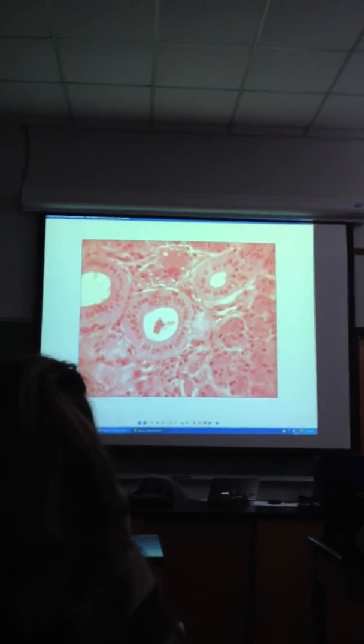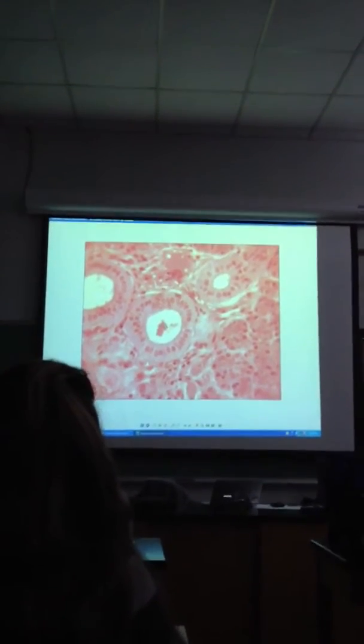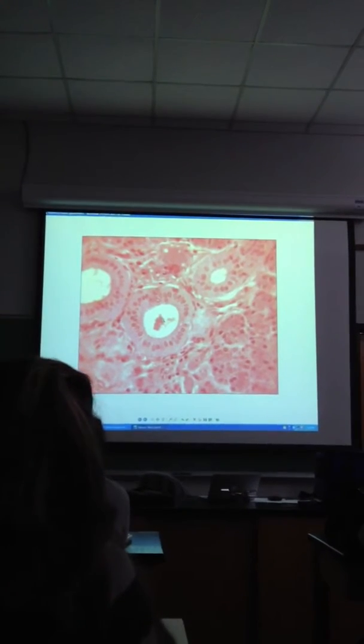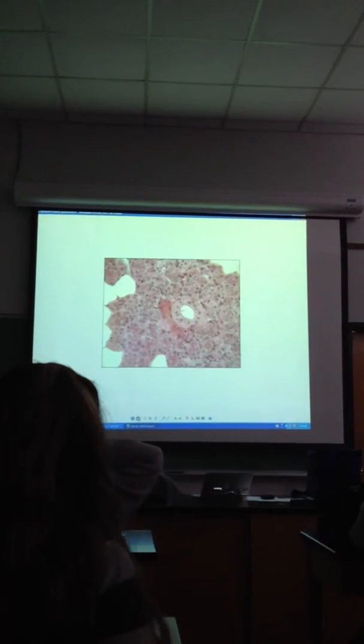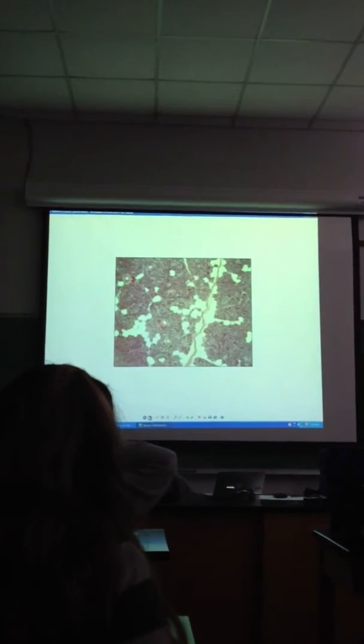So look for these circular shaped secretory portions that are lined by simple columnar epithelium. Nothing else is going to look like that. Nothing else is lined like that. All right? So you definitely need to make sure that you're on top of it. And they're called what? Salivary glands. No, the little circular shapes. The secretory portion.